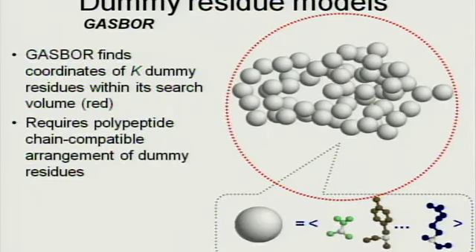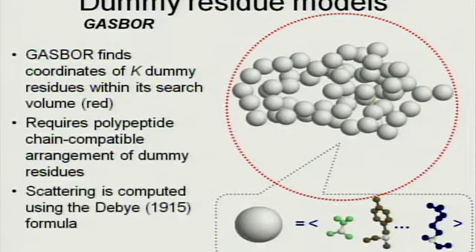And you will get a higher resolution looking model. So typically when you perform this type of modeling, you also take higher angles into account, as long as they are not total noise. You can do that. And this way you get a slightly more detailed model.